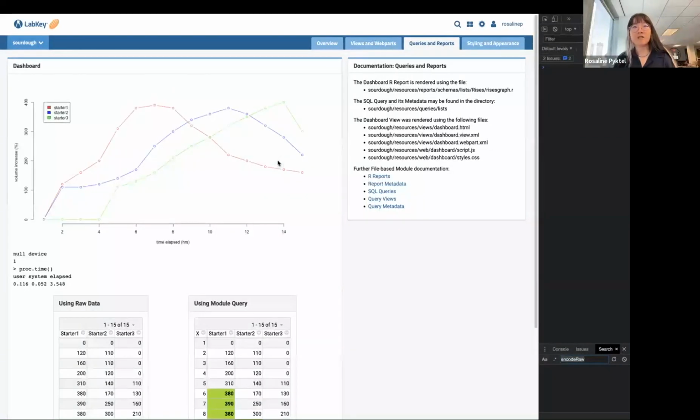As a plug, I highly recommend checking out our JavaScript docs if you want a good sense of what the LabKey API can do. One thing we could have done for this demo is use the LabKey API on this page to execute arbitrary LabKey SQL and do whatever with the data rows that come back. Display them, use them while executing another call. Lots of options out there that aren't in the scope of the demonstrative purposes of this demo.